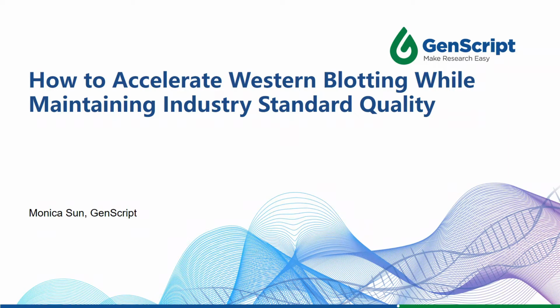In this webinar, I am going to talk about the current methodologies and bottlenecks of Western blotting, and more importantly, how to accelerate Western blotting with the optimal solutions while maintaining industry standard quality.